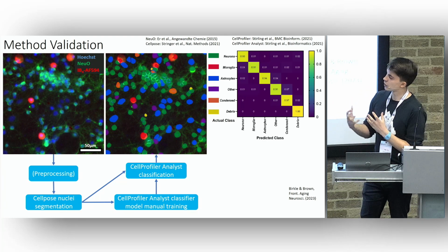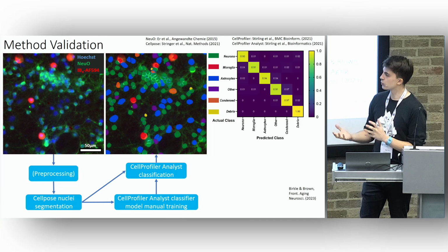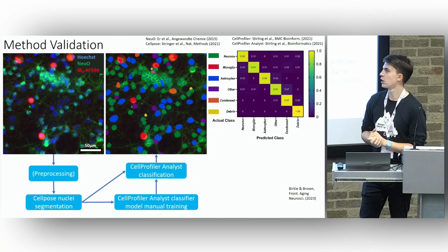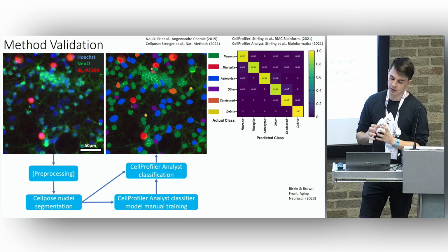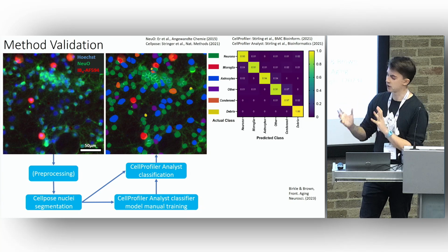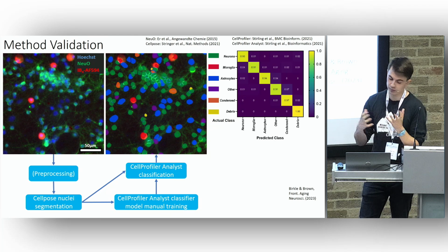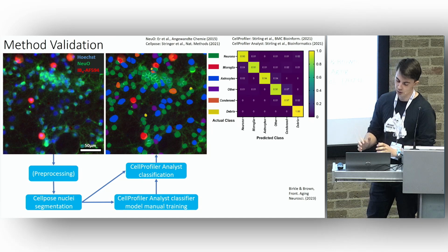What we can essentially do is use relatively recently developed open-source tools to turn these images into a quantitative output on neuronal loss, microglial counts, etc. The key steps are using Cellpose, which some of you may know is an open-source, deep learning-based segmentation algorithm that is nearly the gold standard in segmentation at this point.